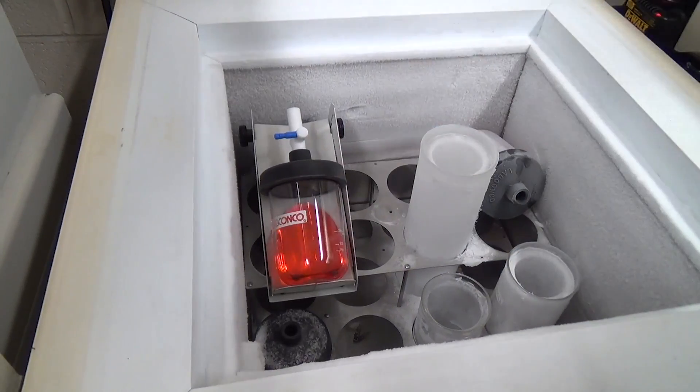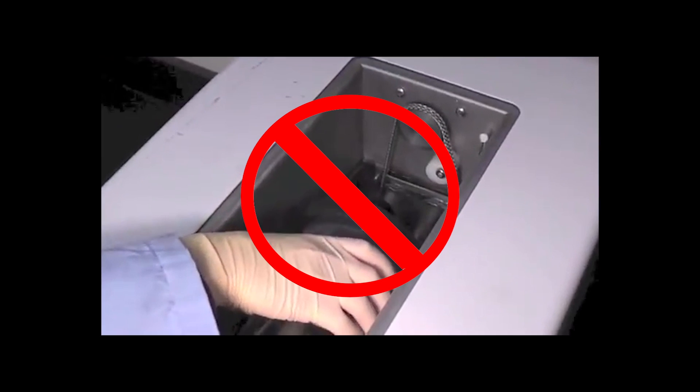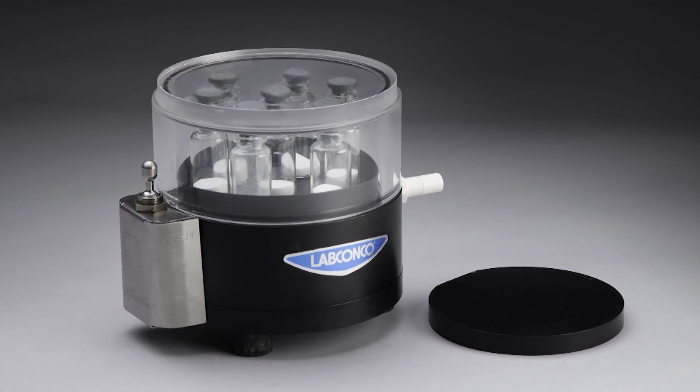Transfer the flask to the freezer and pre-freeze your sample at an angle so the surface area of your sample is increased. Labconco does not recommend attempting to place a flask into a shell freezer with the aseptic adapter attached.